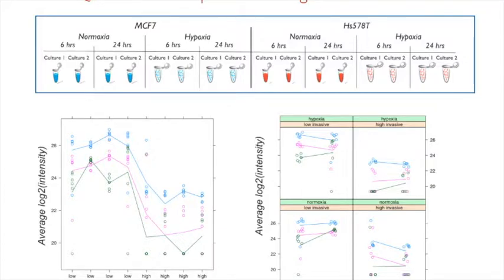So each combination of conditions, she actually had also multiple types of cell cultures and multiple types of extraction. And then she also had technical replicates. So quite a few layers of variation potentially in this data set. And so this would be one data set in this study. So here the x-axis is the combination of all the conditions.